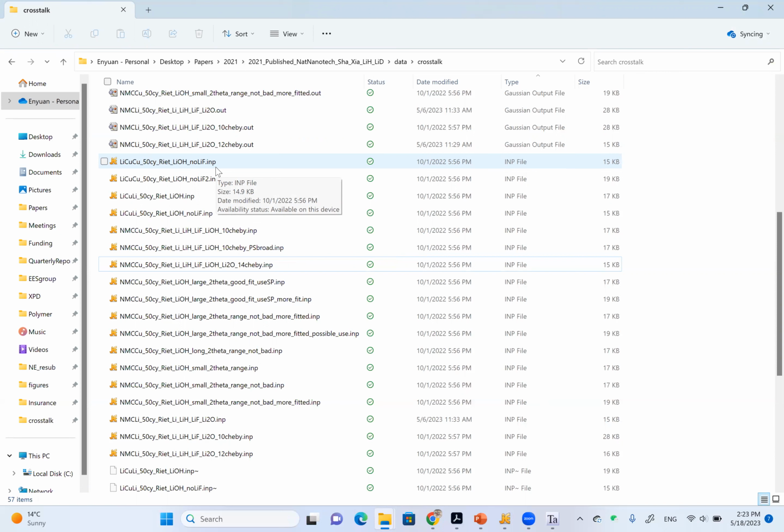But for this kind of data, you really need to be careful. Each time you make progress, you always need to save the file immediately, so that you're not making random trials, but getting closer and closer to a good refinement in a step-by-step way.